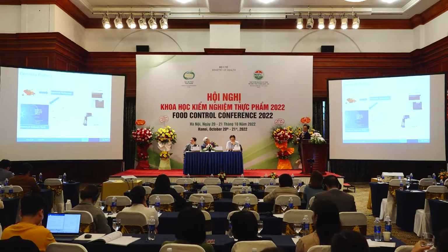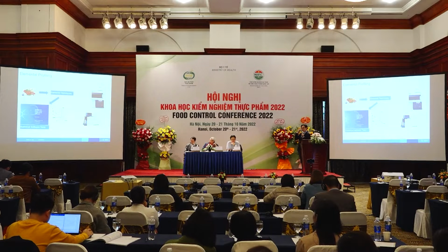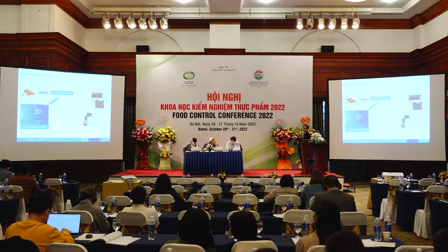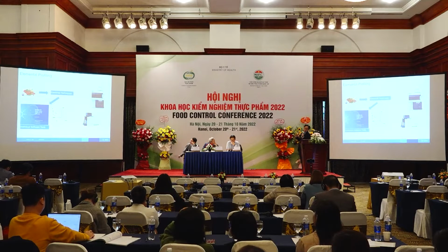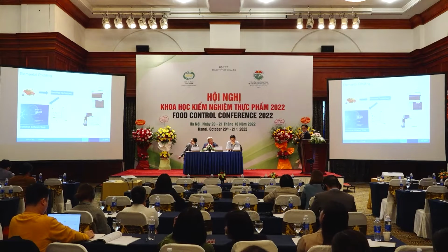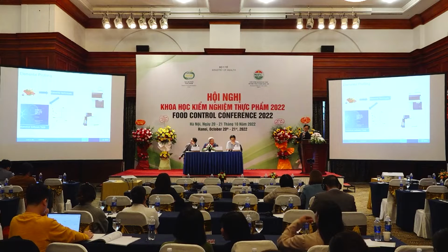We have a software we call MassHunter MPP, Mass Profiler Professional. It is software that we use a lot on our LCMS to do proteomic and metabolic studies, but we find that it can be used to look at elemental profiling as well.